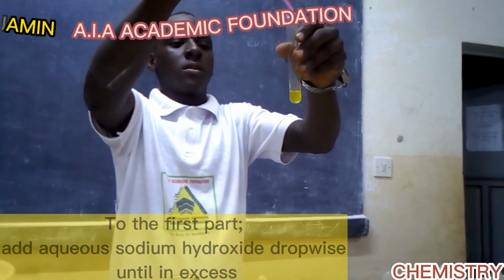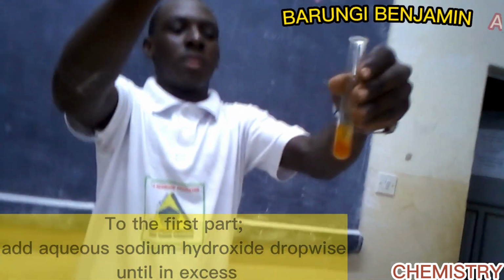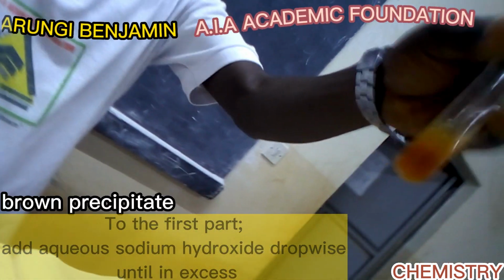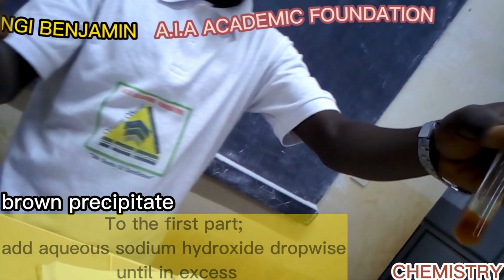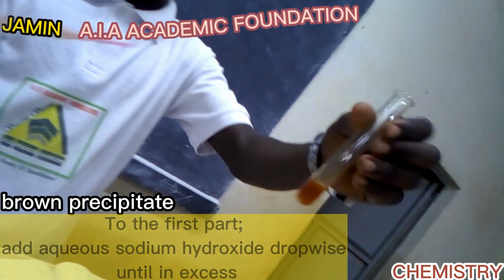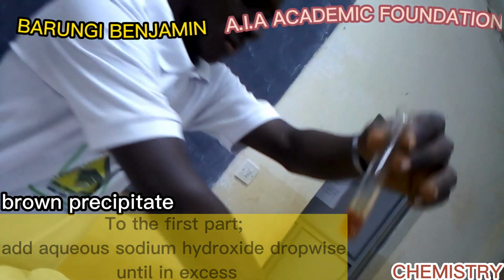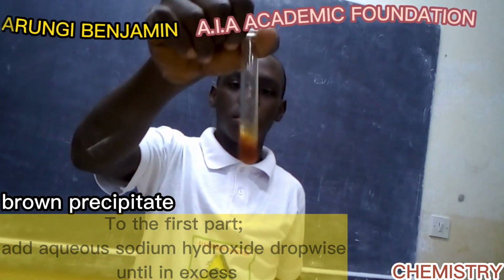As you can see, when we add sodium hydroxide, there is a brown precipitate which is formed, and this proves to us that we have got iron 3 ions in this solution.